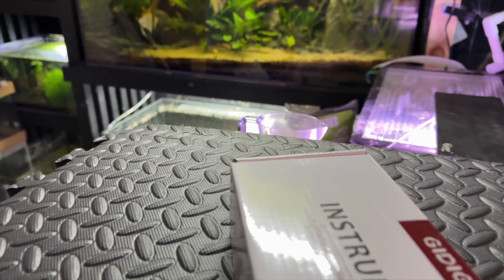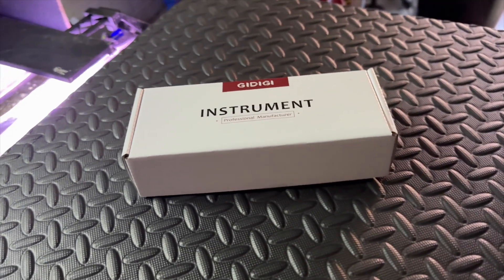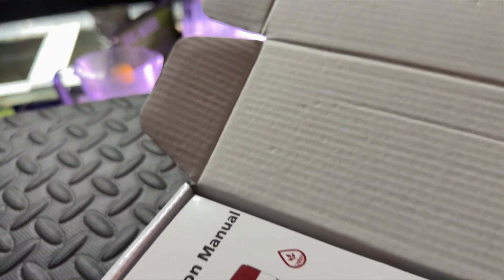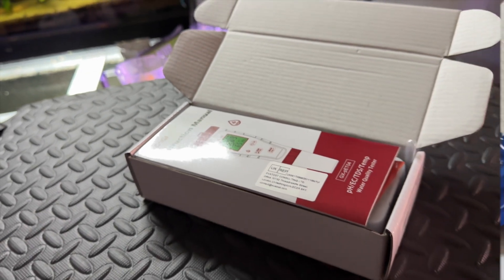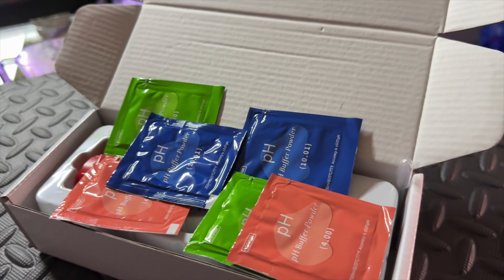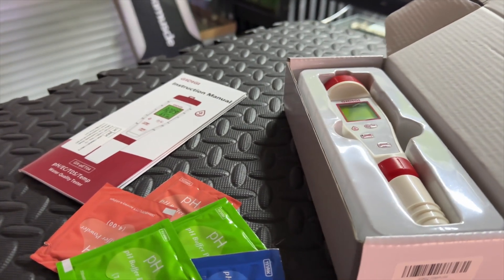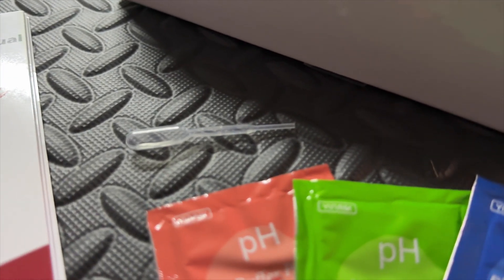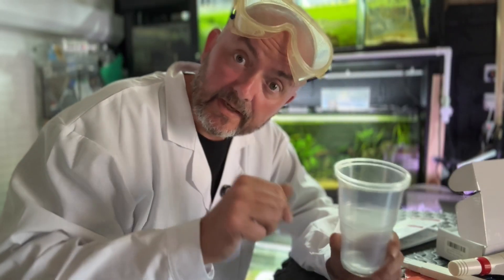Before we proceed, let's have a quick look at the GXPET04 water quality tester. This is the pH, EC, TDS and temperature — that's your four-in-one. In the box you get a glossy instruction manual, a few sachets of pH 7, pH 4 and pH 10 calibration powder, and the test probe instrument itself. As you can see it's all very neatly packed, and for the real scientists or pipette lovers, you get a small little pipette. So let's collect some samples and get started — bring on the science.